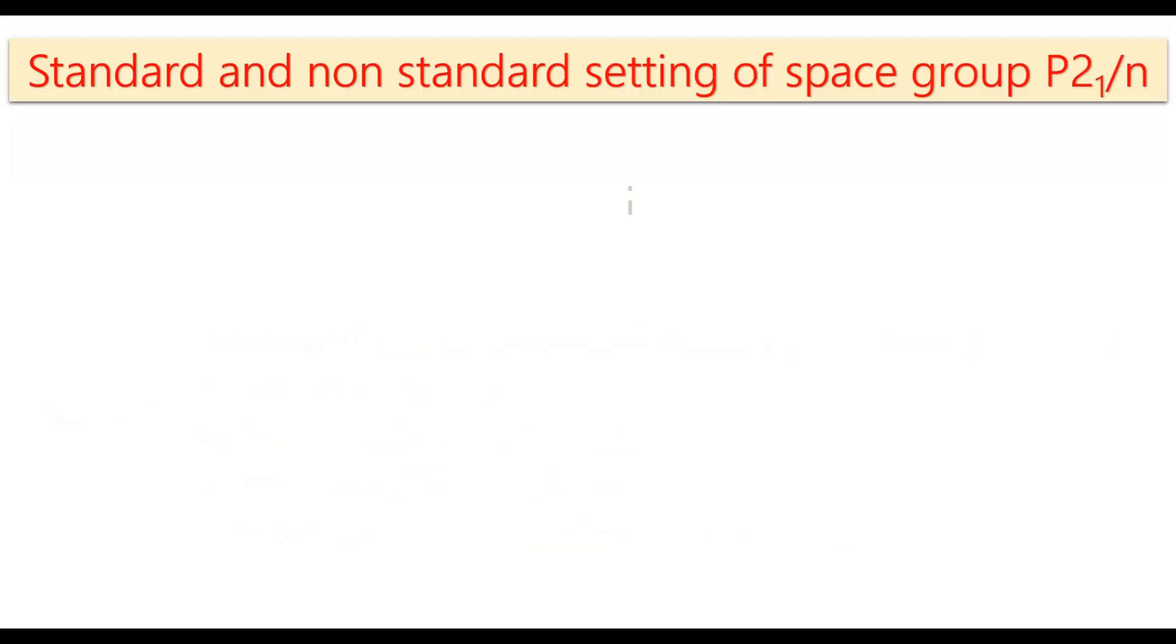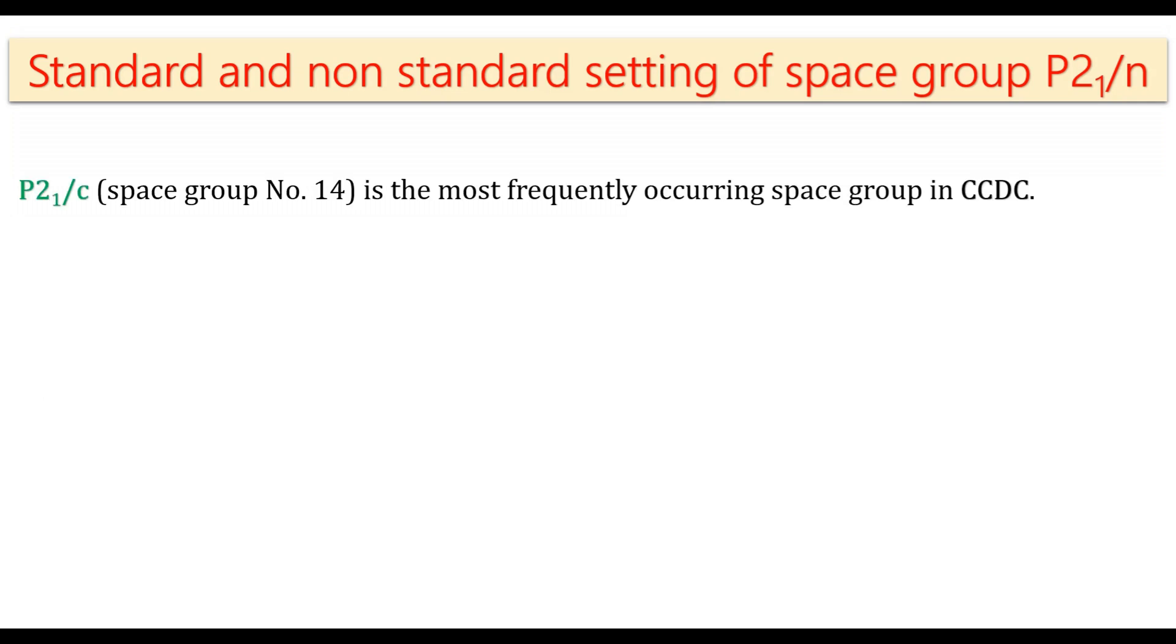First, what is standard and non-standard setting of the space group? P21/c, space group number 14 in the International Table of Crystallography, is the most frequently occurring space group in Cambridge Crystallography Data Center CCDC.